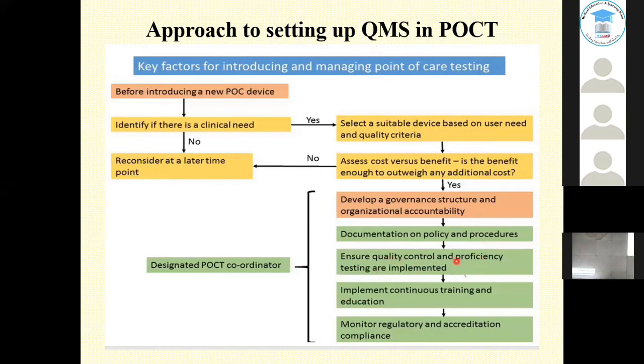Then ensuring quality control and proficiency testing are implemented. Proficiency testing is required, whether you do it in-house by devising something which is cost effective, or you are capable of associating yourself with a structured PT program. That is completely up to you. But yes, proficiency testing needs to be done.